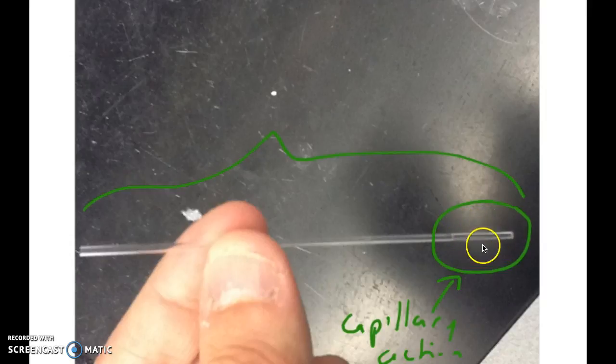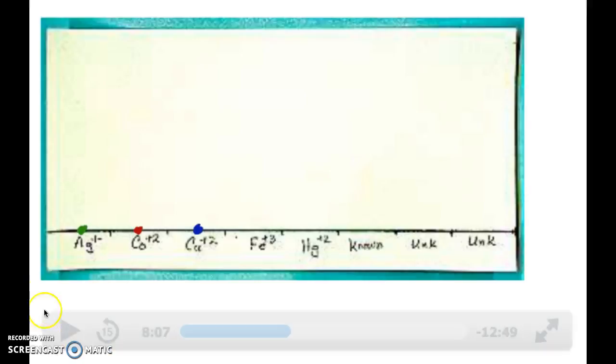That is more than enough sample to spot. You actually only need maybe like less than that, maybe half of that to spot onto your paper. What you're going to do is take that capillary tube and just hold it upright, and then put a spot on each of the ions and then the mixture sample and then your unknown sample.